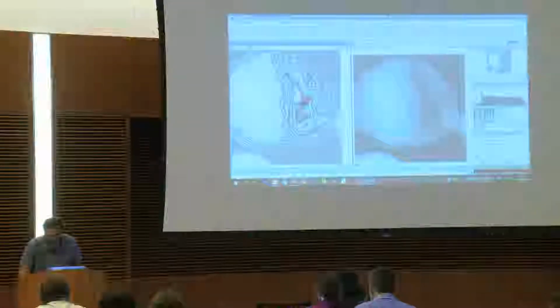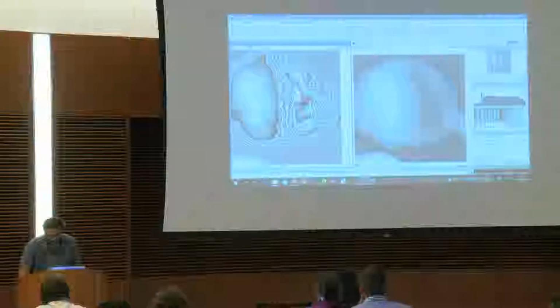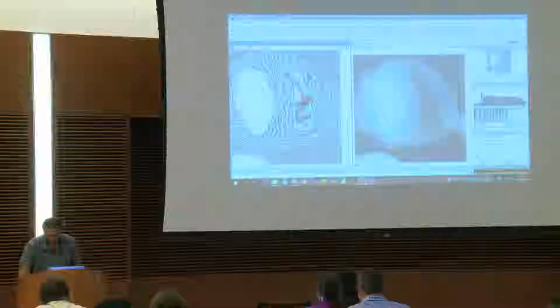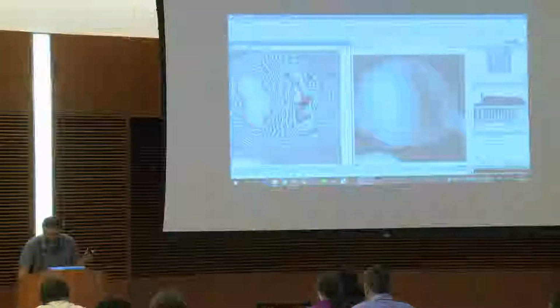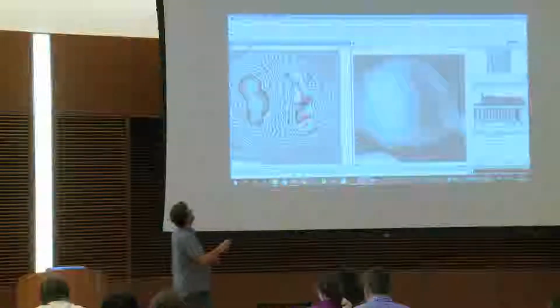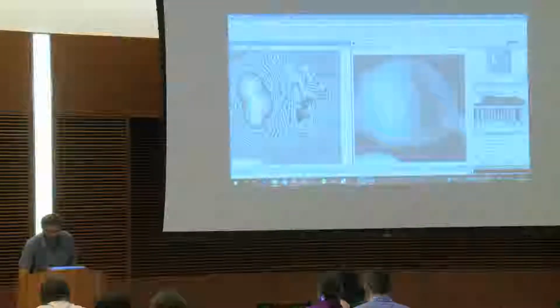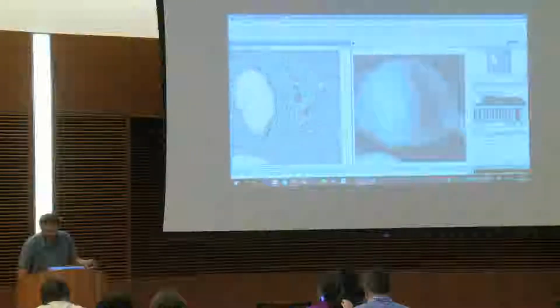Okay? So in fact, what we are doing here is that we are completely artificially, and people could discuss about this, I'm sure, changing the dynamic of the pixel from neighborhood pixel in intensity, neighborhood class of pixel in intensity, I would say. Okay? So now we have those dots that are appearing. And you have a very nice effect if you are moving the boundaries here, because the things, of course, are going to roll. So why is it rolling like that?